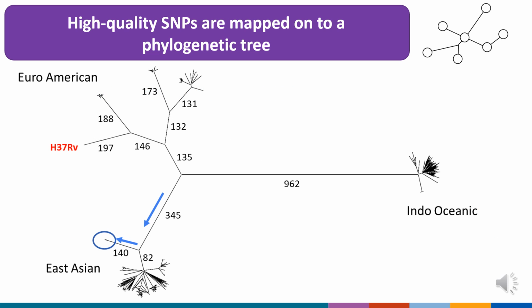This is the big picture, zoomed-out view of where our 3 isolates of interest, shown circled in blue, fit in the context of other Mtb strains of various lineages, including the reference strain H37Rv. When we look over a much larger evolutionary timescale, the direction of genetic change, shown with the blue arrows, is more obvious. So we can use something that's relatively distant, like H37Rv, to infer the most recent common ancestor of our 3 isolates of interest, and the direction of genetic change.